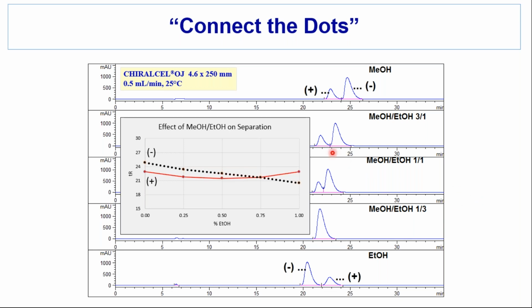And so I think plotting the data matters. If I just looked at one or two data points, particularly if I had not had a way of isolating the two enantiomers, such as a chiral detector or a difference in concentration, I would have thought, oh, it doesn't matter whether we go with methanol or ethanol. But by adding a few data points, I think we can see in a systematic way how the behavior occurs. Again, this is probably not particularly profound for this example, but it'd be a little more noticeable in some following examples.